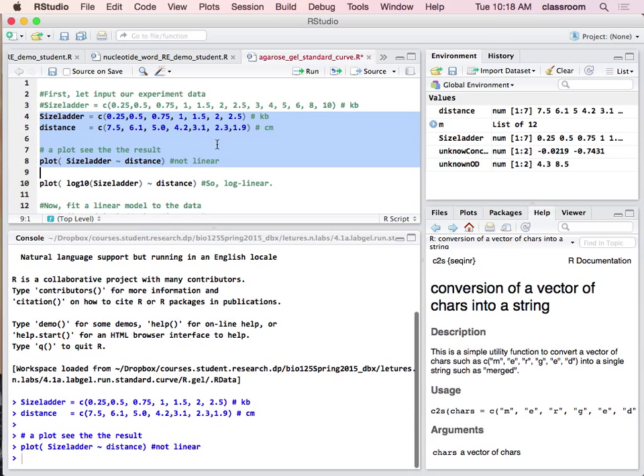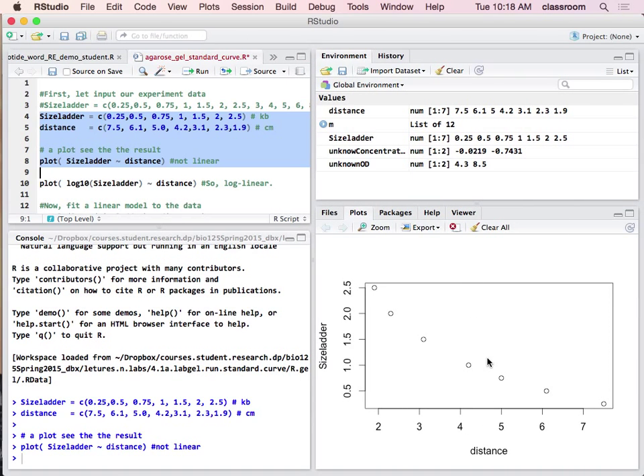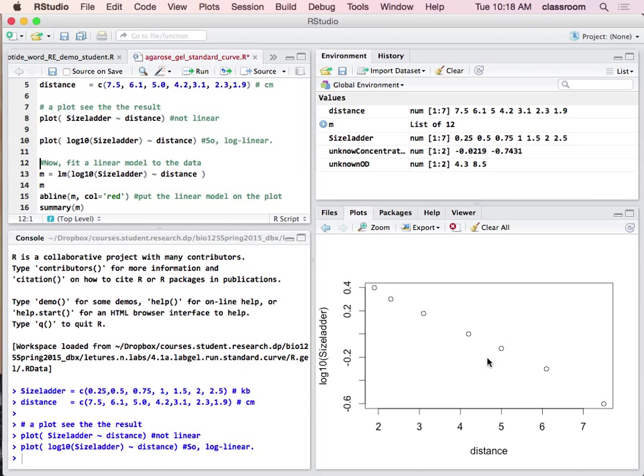Then you plot the data. Once you do a regular plot, you see that the data is not a line — it's a curve. To change this to a line, it turns out that if we do a log transformation of the DNA size and then plot it again, it becomes a line. So for the agarose gel ladder, it's log-linear. All we need to do is a log transformation of the DNA size ladder.